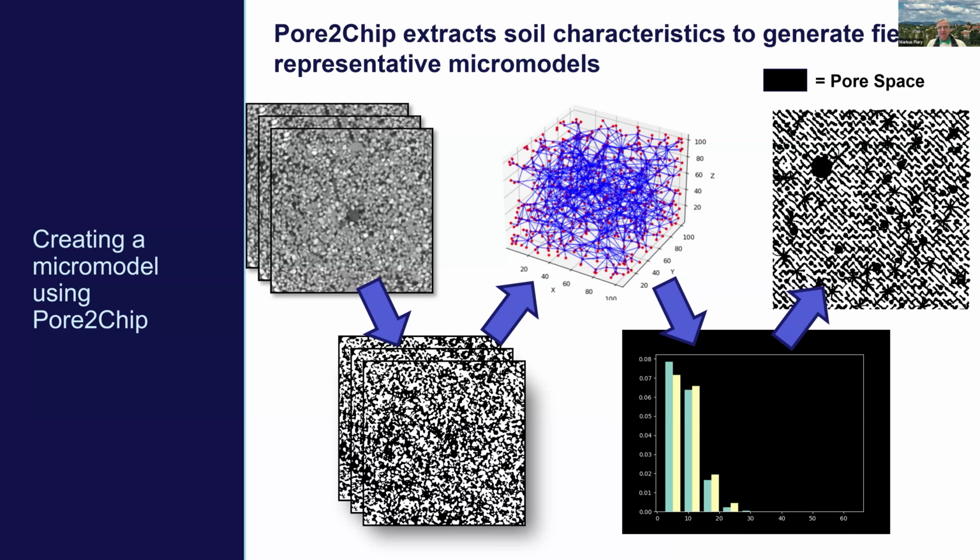Yeah. Very nice. So one question, since you mentioned the tortuosity, do you have any other thoughts on other metrics that should be considered when doing the comparison between 2D and 3D? Yeah, I think the tortuosity would be a good one. Of course, tortuosity is more of a continuum parameter compared with the ones that you use, right? But I think that would be important to do.